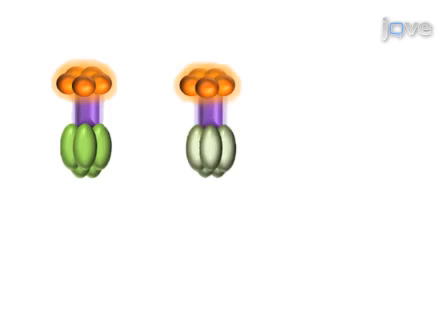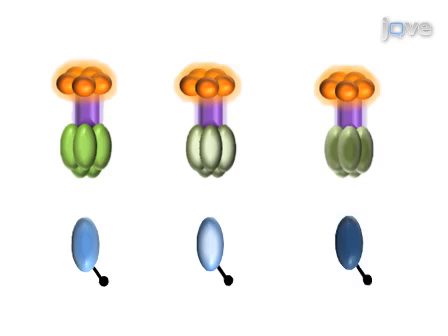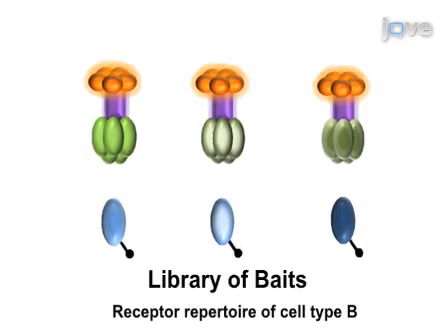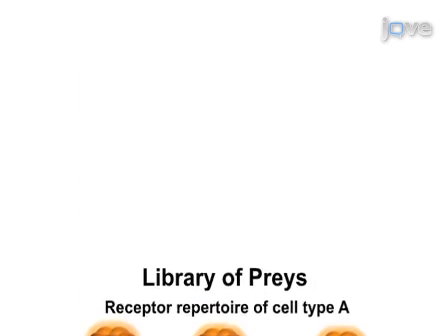The second step is to express and normalize the proteins to be ready for interaction screening. All the proteins are produced in mammalian cells to ensure that post-translational modifications such as disulfide bonds and glycosylation are added. A crucial step in the protocol is to ensure that the bait and prey proteins within the library are all normalized to within threshold levels.